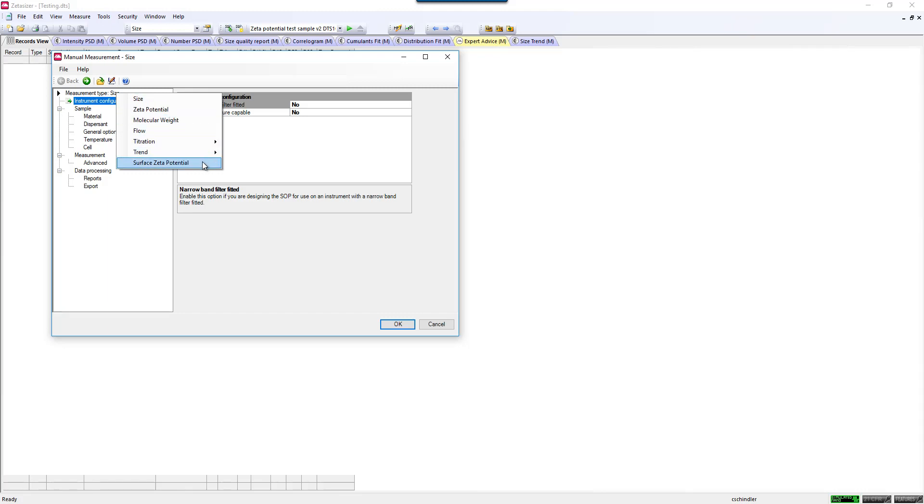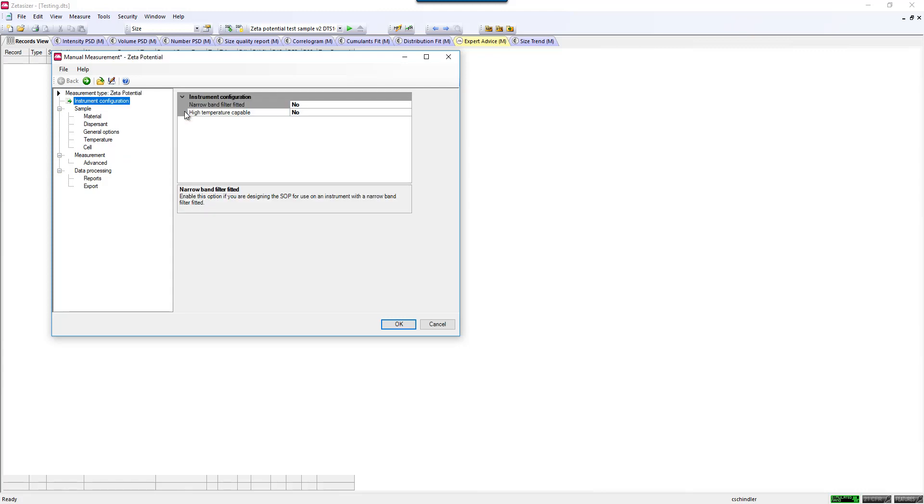There is another Zeta Potential measurement called the Surface Zeta Potential measurement. This is with a specific accessory to measure thin films, membranes, or coatings. For normal Zeta Potential measurements, you would click Zeta Potential.